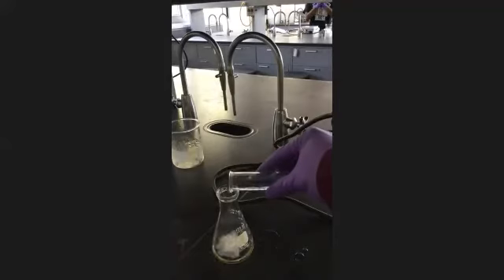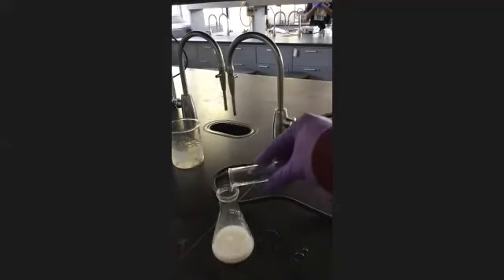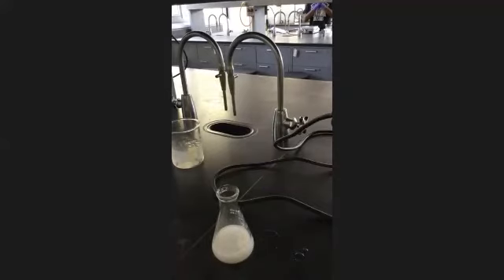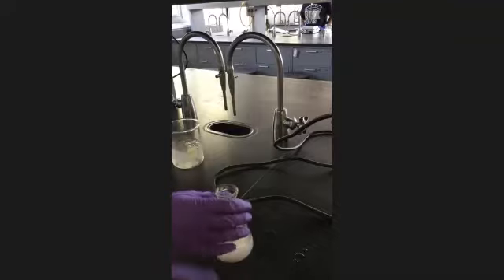And it's cold water, and you can see it turn cloudy right away. That aspirin is not soluble in water, so when you add that water, the aspirin itself is gonna start coming out of solution. And then when you cool it off, it's gonna come out and crystallize. Right, so that's what we're gonna do now. We're gonna take that, put it on ice bath, and just let it sit.